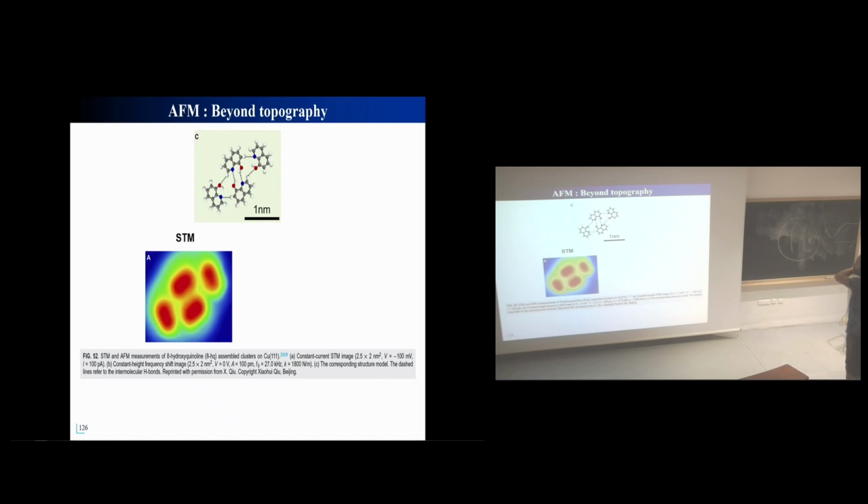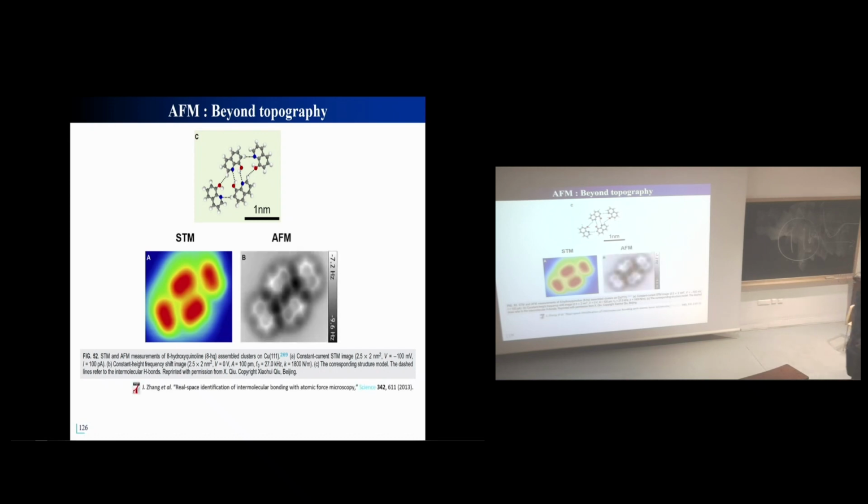It's absolutely not related to oxides in this case, but I love it. When I was a student, I always heard it's impossible to have atomic resolution with AFM. Only STM can do that. It's not true. Thousands of students around the world get atomic resolution every day with an AFM.